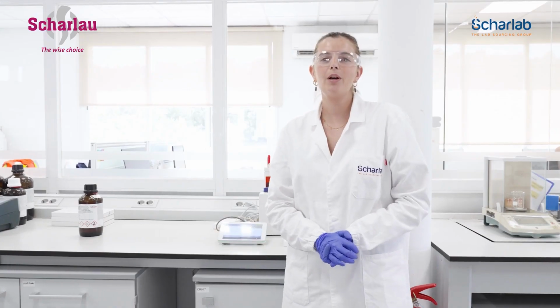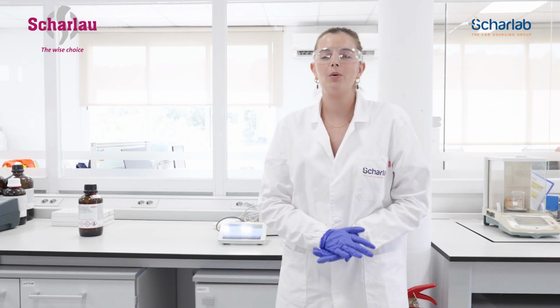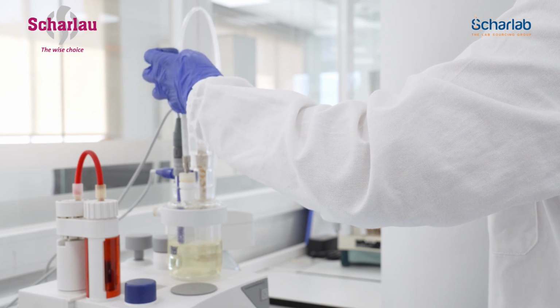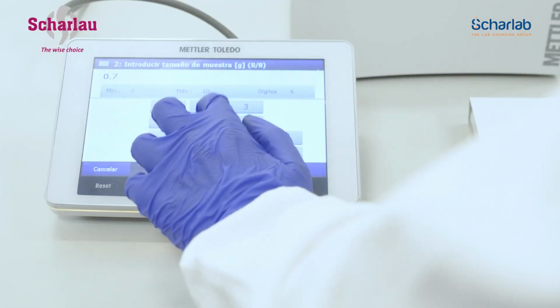For today's demo, we are going to measure the amount of water in an acetonitrile sample. Previously, we already weighed the syringe with the sample, and now we are going to introduce the sample into the cell. We weigh the syringe again to determine the difference in weight and enter the resulting value.